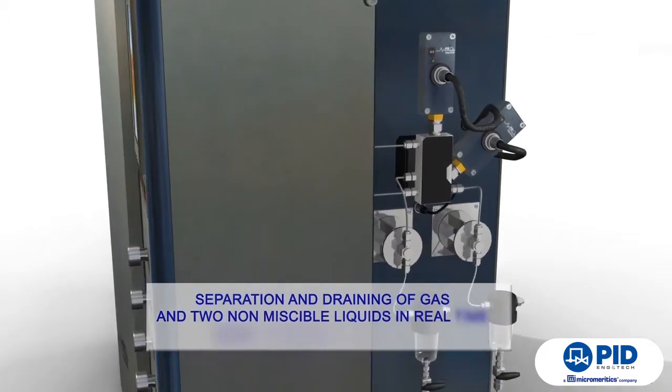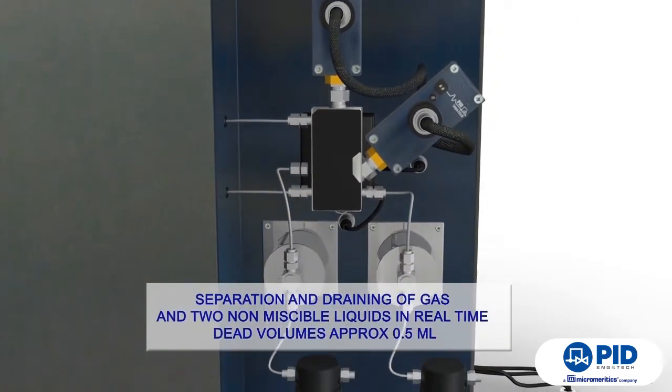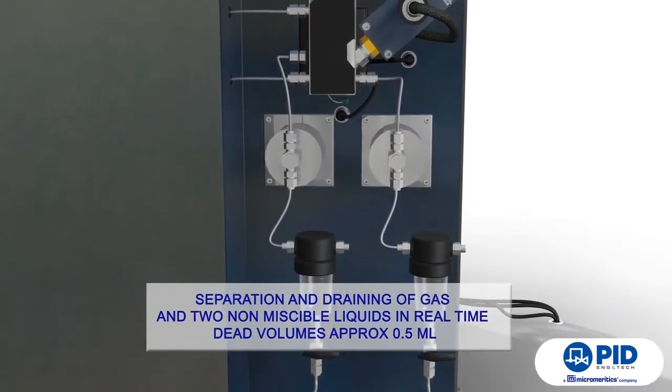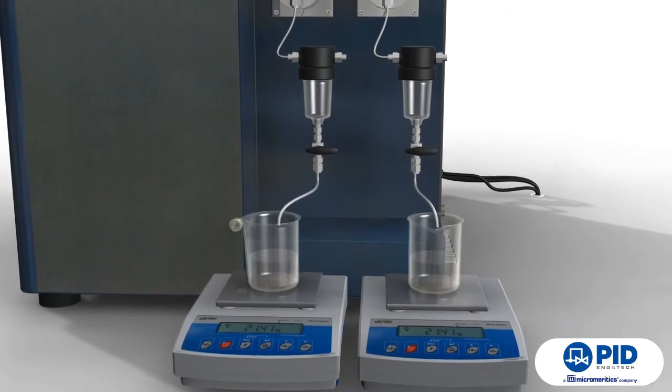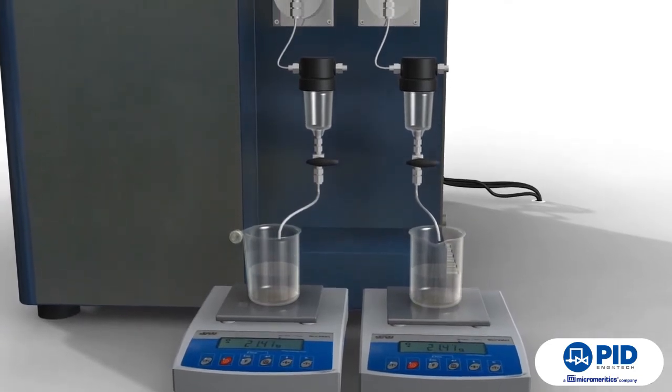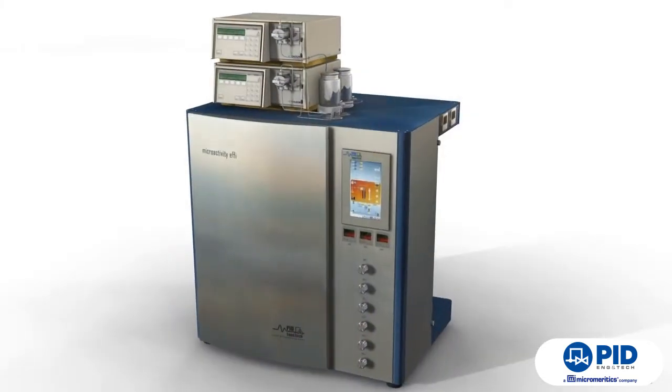The L2 separator is not only able to separate gas from liquid at operating pressure with dead volumes of approximately 0.5 milliliters, but also of separating and draining in real time two non-miscible liquids, controlling the level of each one independently with a very high accuracy.